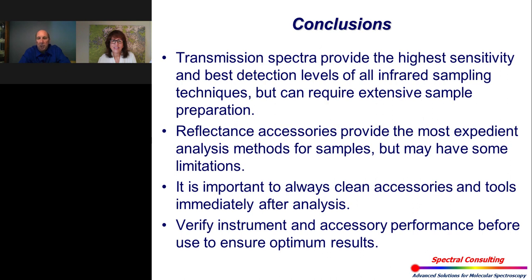Thanks, Judy. Yeah, that's a good question because we kind of touched on it in the presentation. We just have to be very careful in comparing the data collected with the ATR to data collected from some other method. Now, if I compare one ATR spectrum to another ATR spectrum, we won't see a whole lot of difference there. But if we're trying to compare it to a diffuse reflectance or a transmission spectrum, we may see some differences in the relative intensity peak values, and that could be a little bit confusing. Also, there can be some slight peak shifts using the ATR technique. And again, as long as you're aware of those things, you should be fine going forward.